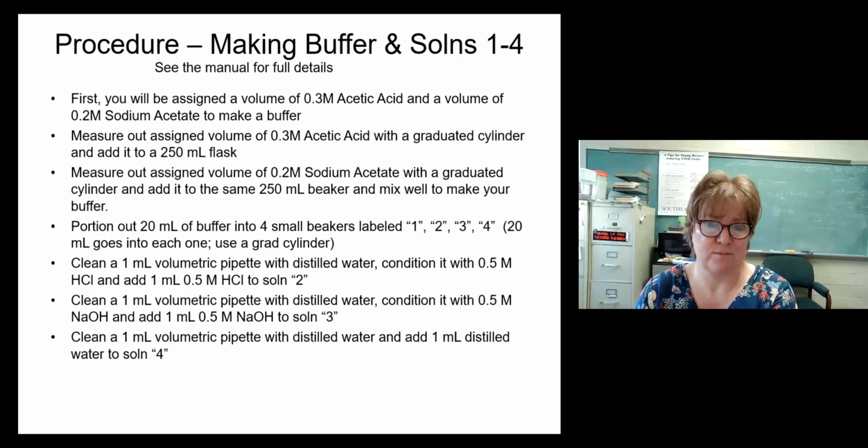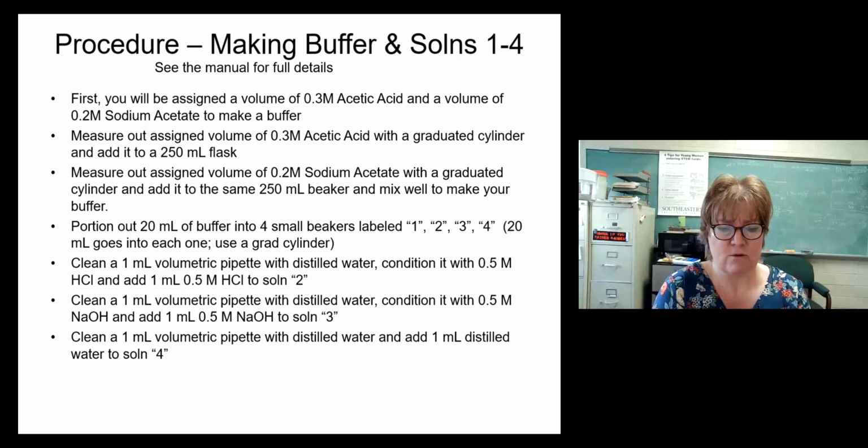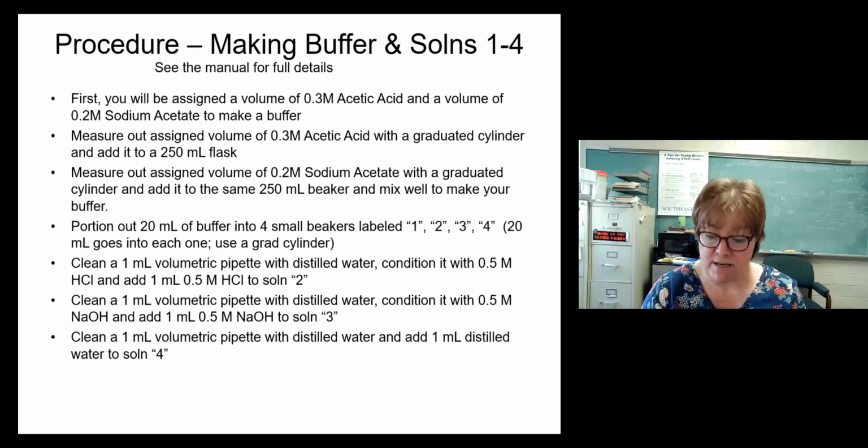One we're going to just use plain buffer. The second one we're going to add 1 milliliter of HCl to. The other one we're going to add 1 milliliter of NaOH to. And one we're going to add 1 milliliter of water. Then we're going to measure those pHs.